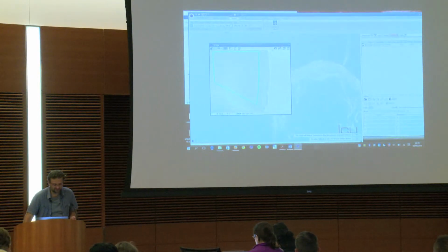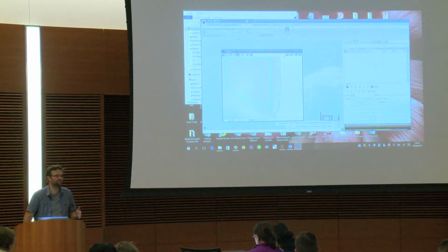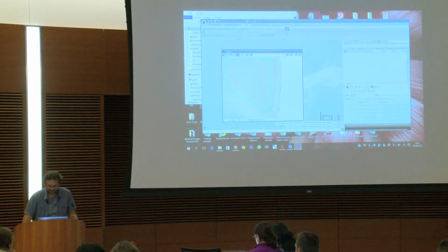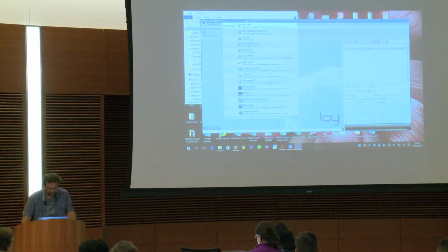And in ImageJ2, as the format is exposing the input and the output, potentially we can use ImageJ2 as a lib in IC and keep ImageJ1 and put the ImageJ2 plugins as a protocol as you saw before. And now I just want to show you the script, and I'm done very, very fast because we had a lot of effort on this.